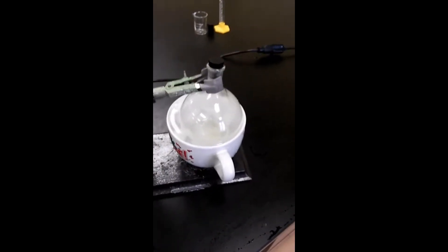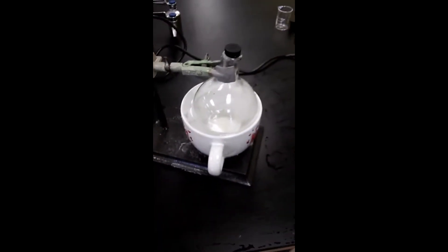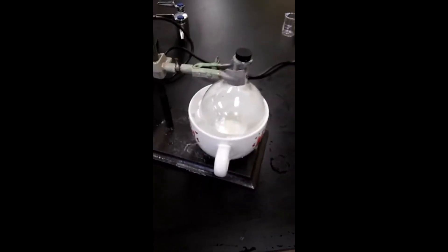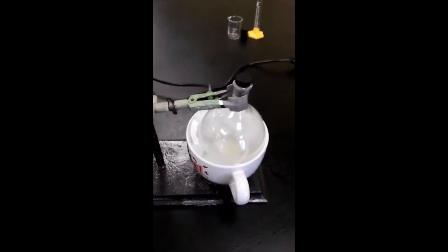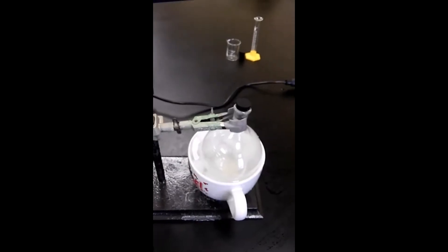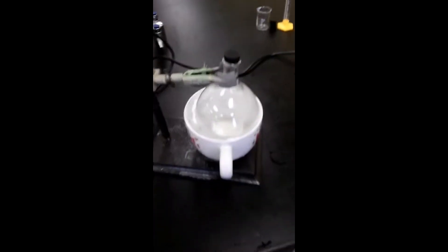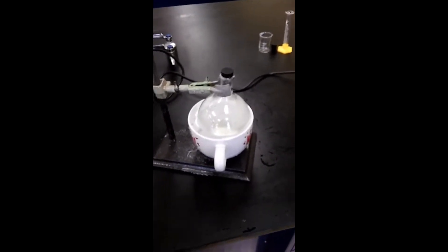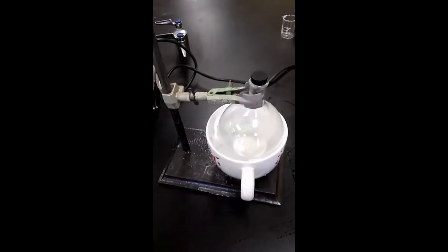I have an ice bath here and I clamped the flask just to be extra safe. I don't think it's going to go anywhere, but I'm going to let it sit in the flask and see if solid forms. Once solid forms, I'm going to take it out of the bath, leave it with just the clamp on, remove the ice bath, and the next step would be to filter the product. You may not be able to weigh the same day you do the lab because your filter paper is going to be wet and won't give you an accurate reading of the sample percent.